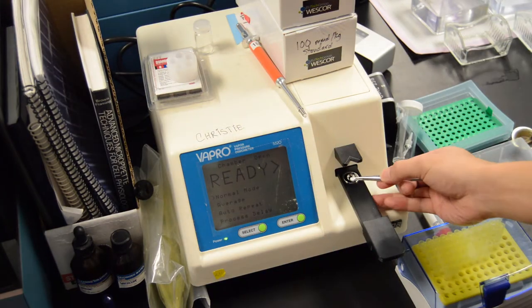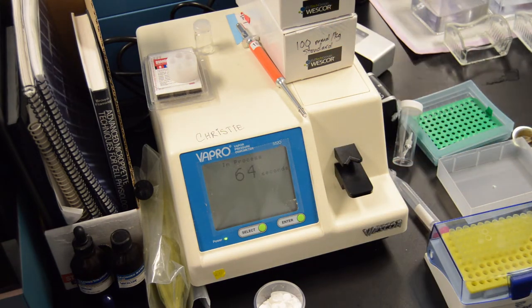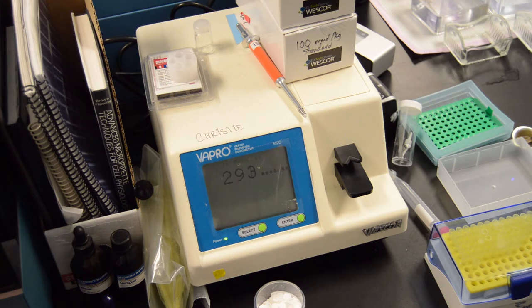After making the solutions, it is important to ensure that the pH of the ACSF falls within the range of 7.3 to 7.4, and also that the osmolarity of the ACSF is approximately 10 milliosmoles higher than that of the internal solution. So in this case, our ACSF tested at an osmolarity of 293 milliosmoles, and our internal solution was tested after and found to be 283 milliosmoles. Having the internal solution at a lower osmolarity allows for lower access resistance, which prevents the chances of the membrane resealing.